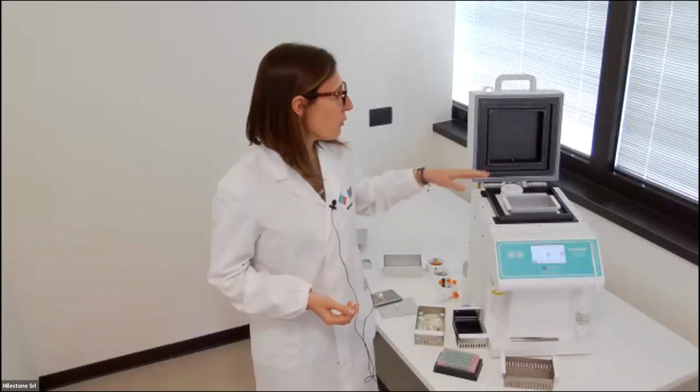In that case the working temperature is -40, and this temperature and the direct contact of the sample with the cold metal allows such fast freezing that the water has no time to create ice crystals, giving a very good and high quality frozen section with the best morphology preserved.